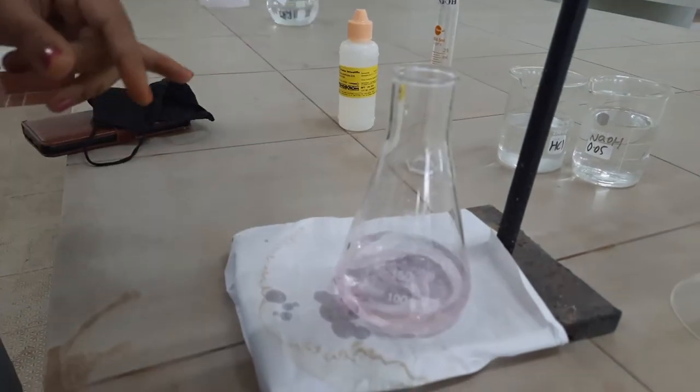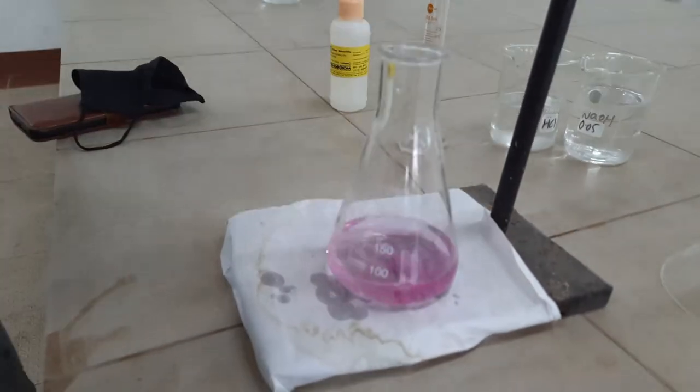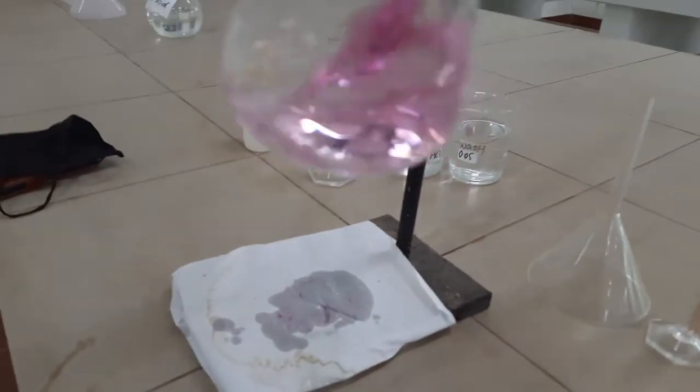Once the permanent pale pink color has been attained, we have to stop the reaction. The color is permanent.